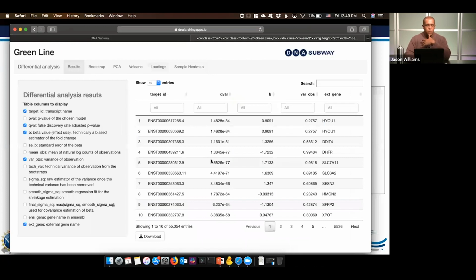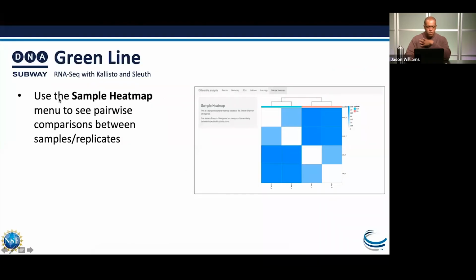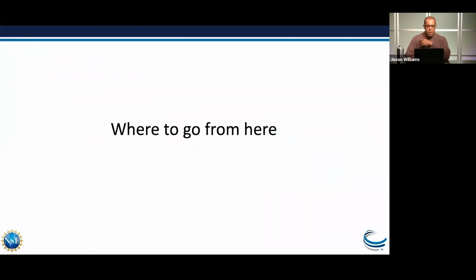I've got about 10 minutes, and I want to get to as many questions as I can. So let me show you just the last few things I want to show you, give you some hints, and then just use the rest of the time for questions. So where to go from here?